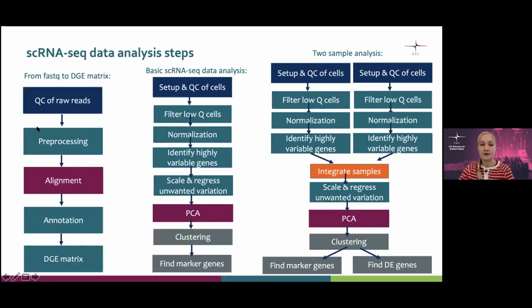In short, it is possible to do the first phase in Chipster, but usually you don't have to. So usually you start from this digital expression matrix, and these are the 2 analysis types that will be covered in the course.